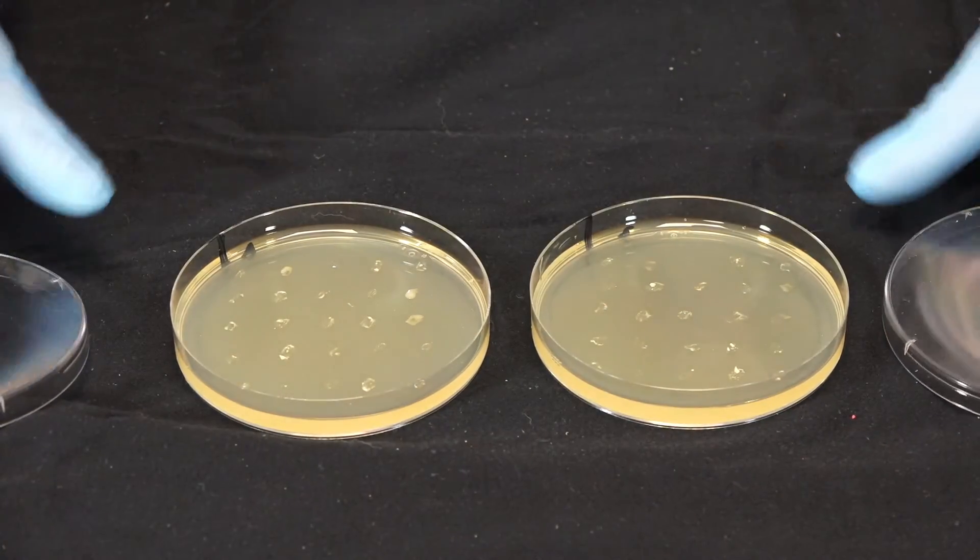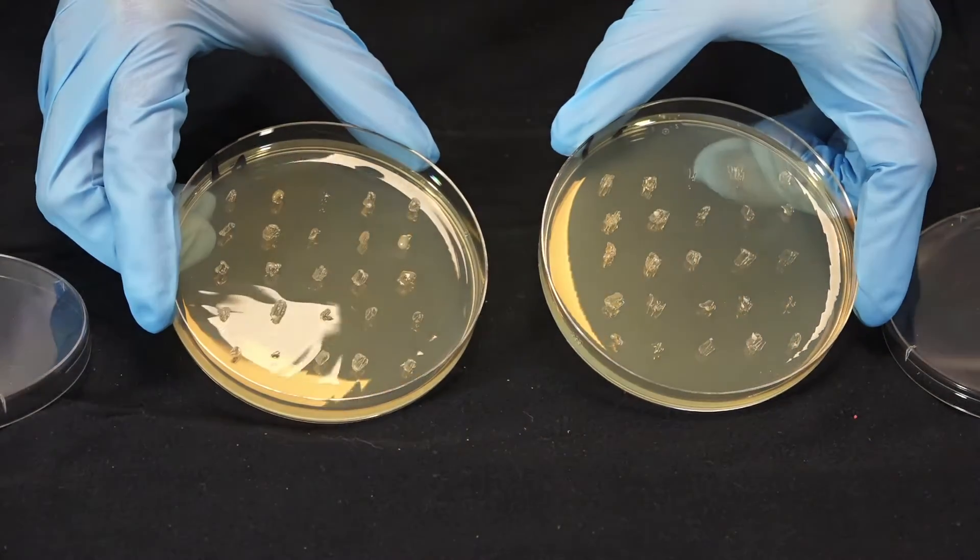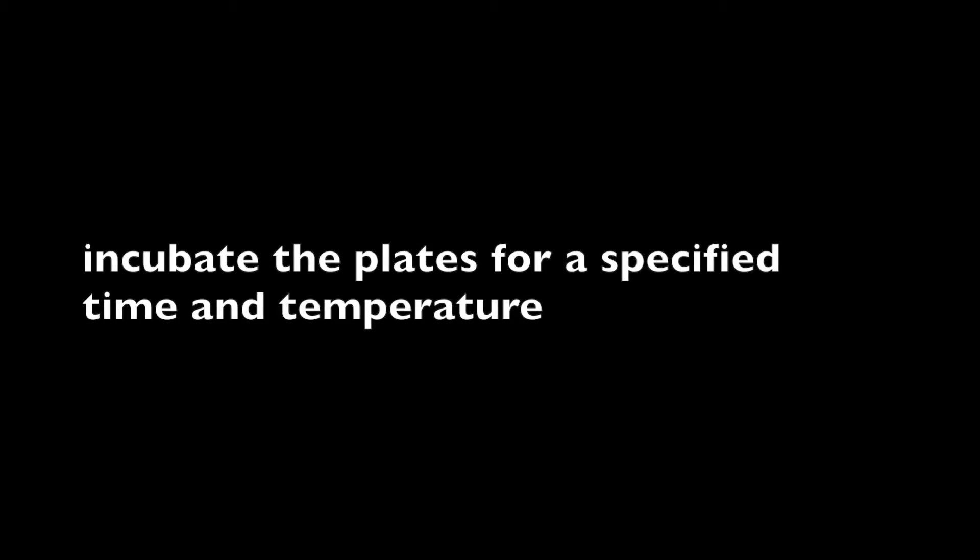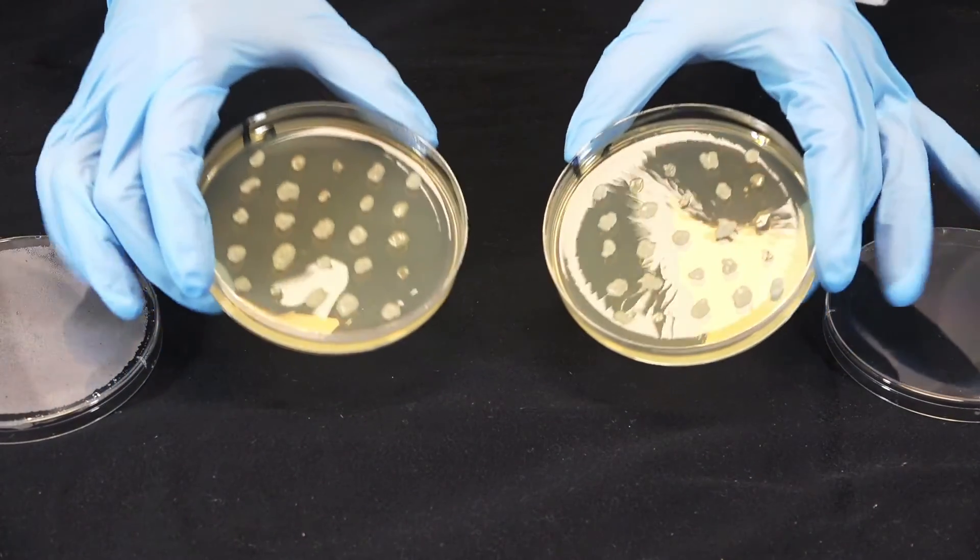Here are the two plates we've inoculated. And these are what the plates look like after incubation.